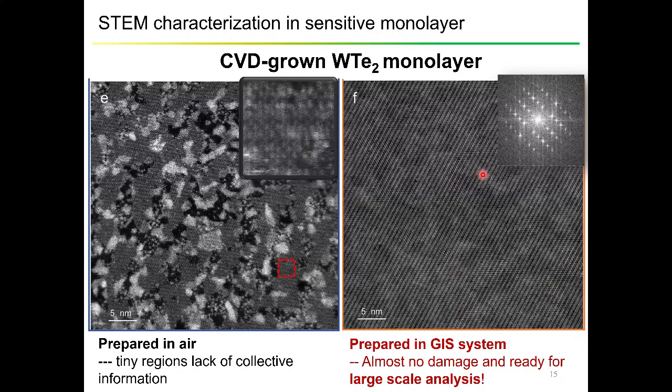Okay. So only by looking at the real space structure, we can already see some interesting phenomena, because you can see a little bit of distortion in the lattice structure like this. And the distortion is a little bit anisotropic. It is not isotropic like I showed previously in the MoS2 monolayer.